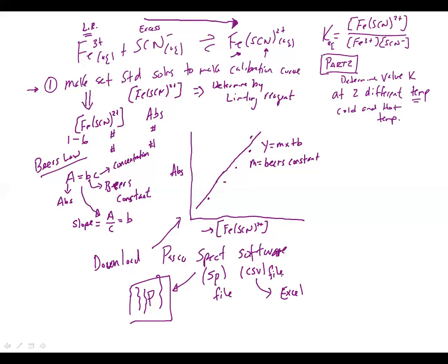And in the procedure, don't follow the procedure that's written in your lab manual, even though it's going to be very similar to what you read online. Follow the ones online. Online, it will have the pictures that you need to look at, and it will give you little clues like, hey, go download this file and use this software, and tell you what to do. Any questions up to that point? So at this point, you will have part 1 done for the equilibrium calculation.